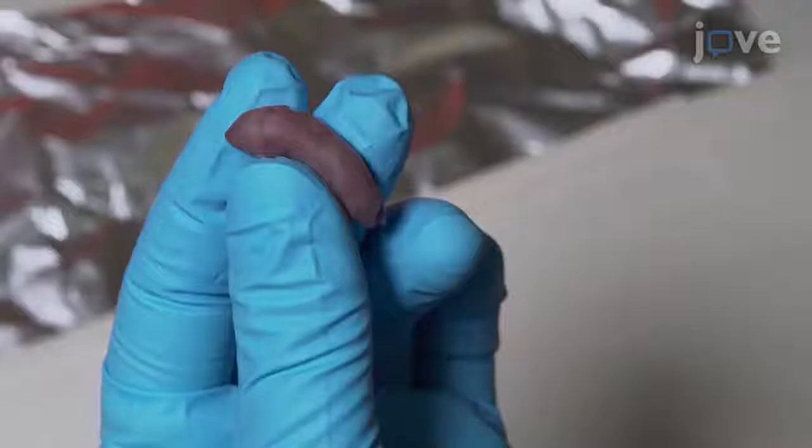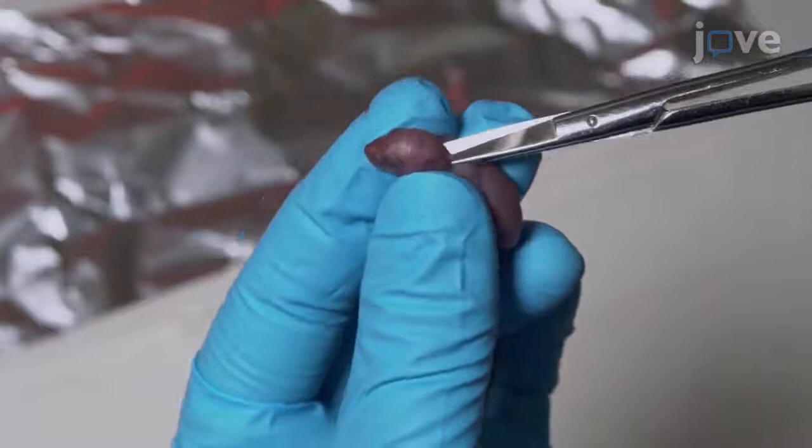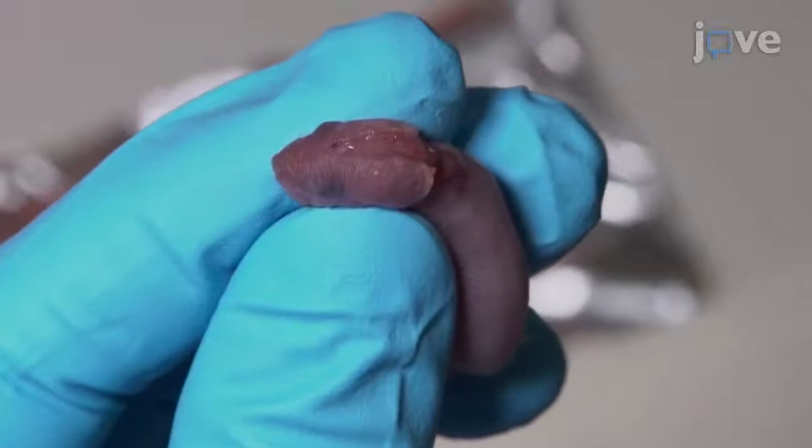To harvest postnatal day 1–3 mouse brains, hold the ventral part of the body at the base of the head and use small pointed scissors to make a midline incision in the skin over the entire length of the head to expose the skull. Make a longitudinal incision at the base of the skull and continue cutting along the sagittal suture at as shallow an angle as possible to avoid damaging the brain's structures.